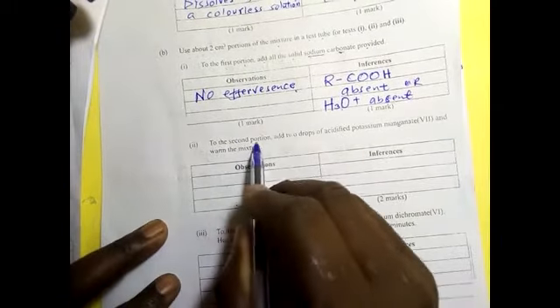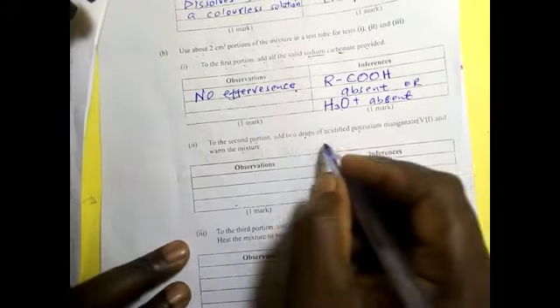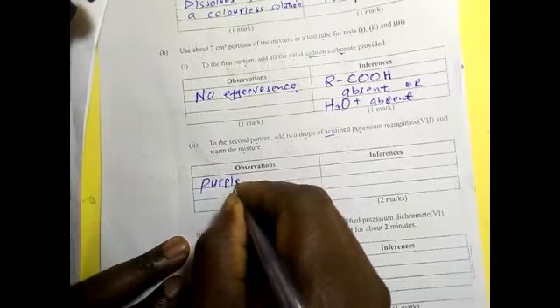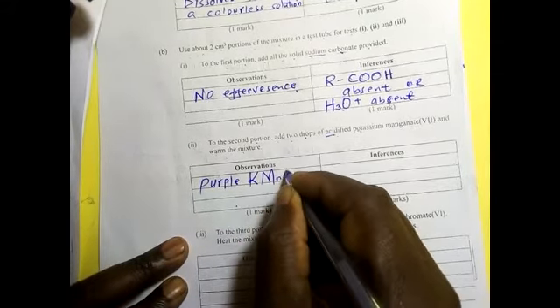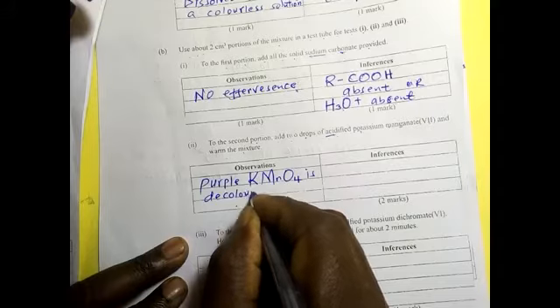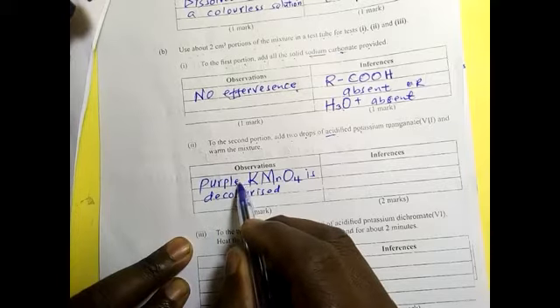To the second portion, add 2 drops of acidified potassium permanganate, warm the mixture. Remember, acidified potassium permanganate is purple, so the purple acidified potassium permanganate is decolorized, meaning that the purple color changes to colorless.